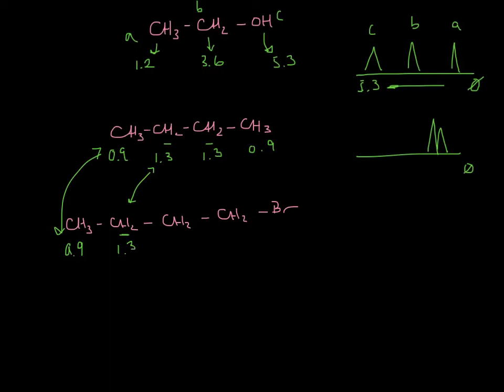Alright, going further to the right, the bromine doesn't show up, but these hydrogens would right here. These hydrogens are CHs next to a halogen. Just like the CHs next to an O that we saw up here, they show up in the 3 to 4 ppm region. Specifically, this guy shows up at 3.4 ppm. I wouldn't ask you to be able to tell me that, just that it shows up somewhere between 3 and 4.